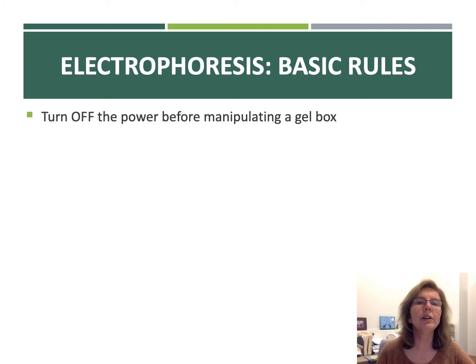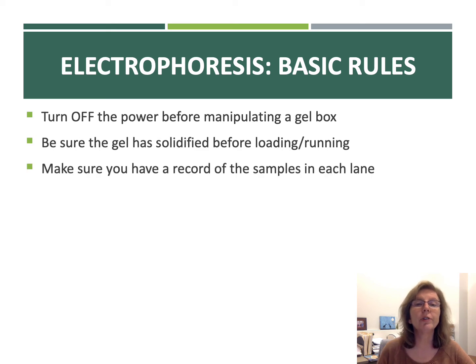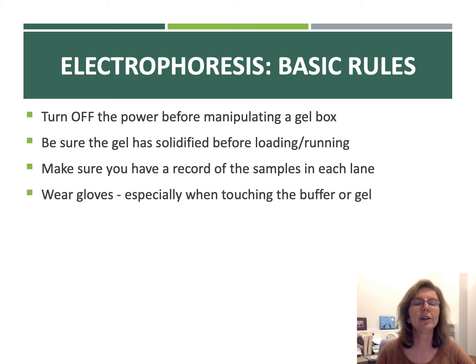So there are some other safety rules with electrophoresis. You want to make sure you turn off the power before you are manipulating anything in the gel box. You don't want to touch the gel or the buffer if the power is on. You want to make sure your gel is solid before you load and run it. You also want to make sure that you write down the order of the samples you've loaded. That's going to be hard to remember, and important when you want to interpret the results. And as I've mentioned, we always wear gloves when we are touching buffer or the gel.